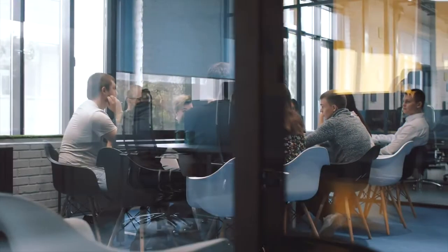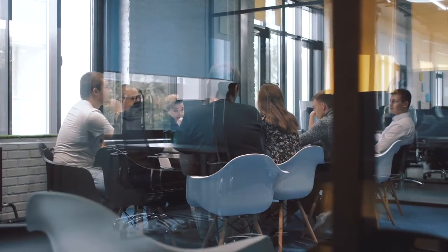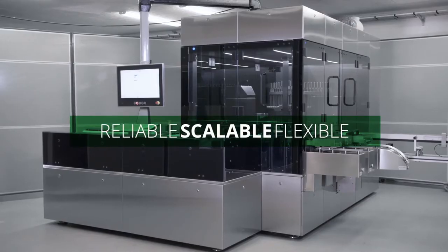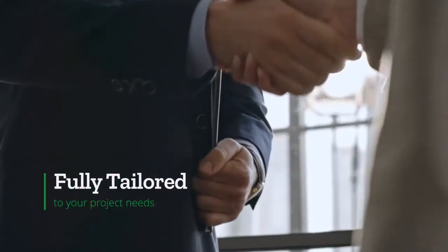For each of our engineering projects, the goal is simple: deliver reliable, flexible, scalable equipment solutions that are fully tailored to your needs.